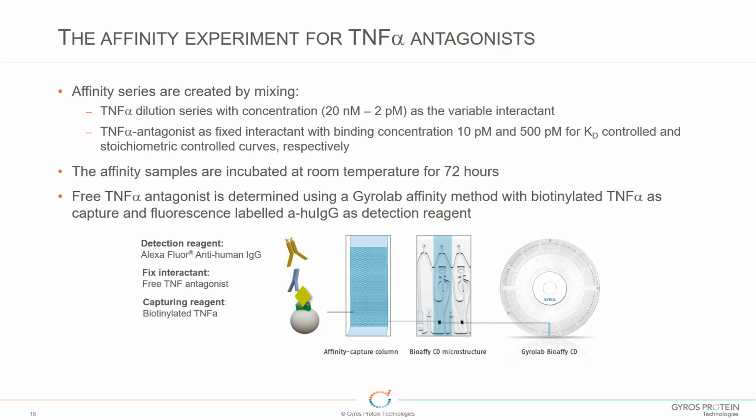After the experiment is set up, it is left to sit. Then, when you come to read it and put it on the instrument, it'll take an hour to generate the results. If you've got the setup worked out, you can probably set this experiment up in 45 minutes to an hour, let it incubate until it comes to equilibrium, and then it's only going to take an hour to screen your whole set of assays. So from a user standpoint, it's not a lot of active time.